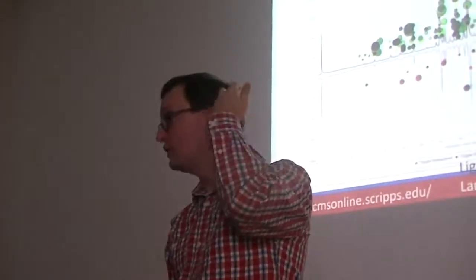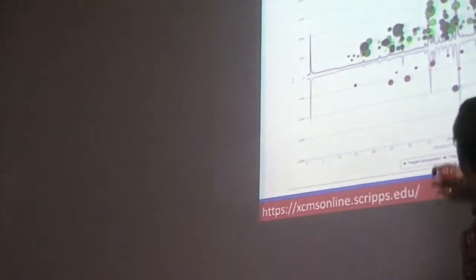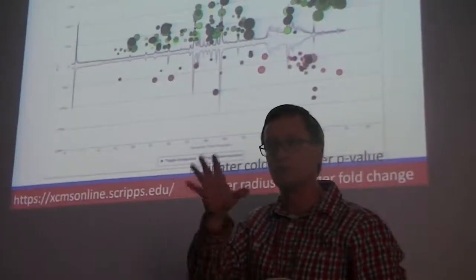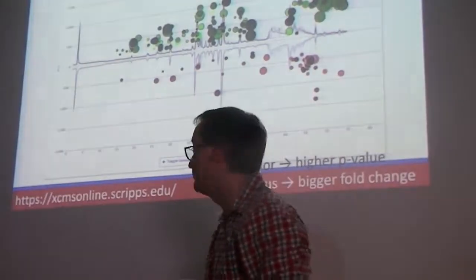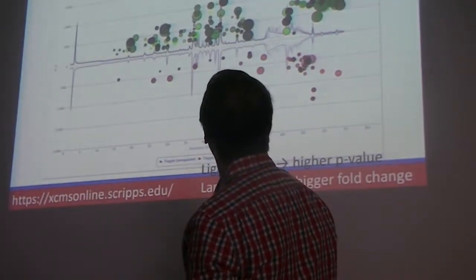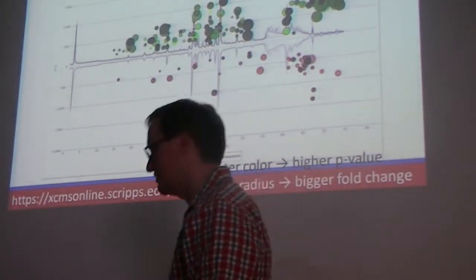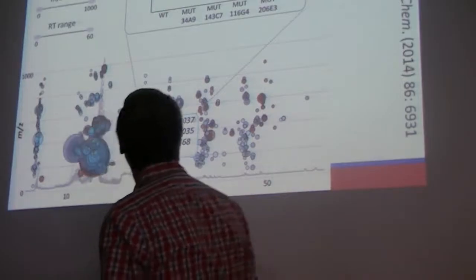Does everyone remember the volcano? So this is an alternative visualization where the circle size and the circle darkness are used to relate these two categories of information. I'm trying to remember what these are called. Was it a cloud plot? I think they called that a cloud plot within their site. Okay.